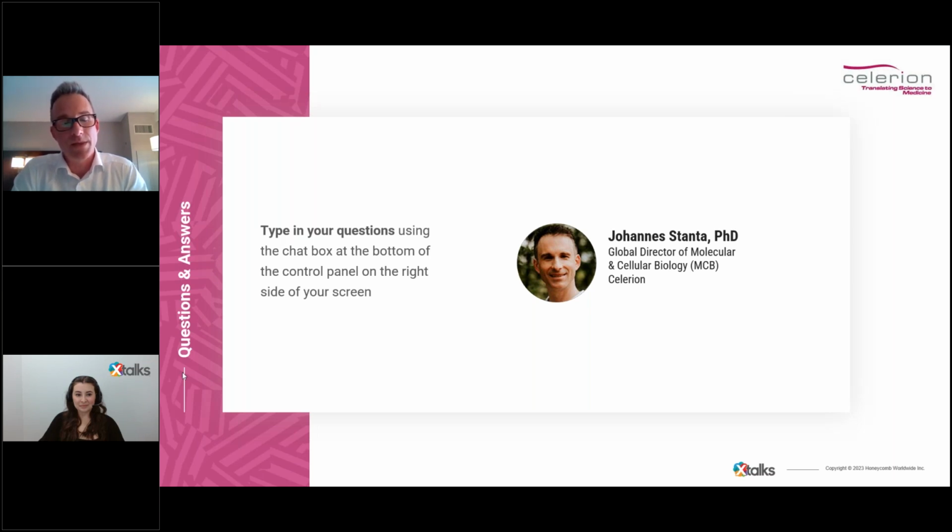especially when the method and the lab haven't carefully validated and chosen the extraction method, which I found has been the biggest frustration with a lot of the validated assays I've seen, where just a kit is used and then processed through. And I think the extraction can be different from one week to the next, from one day to the next. That could then influence the recovery, and that then influences whether the result can still be picked up within the PCR reaction.